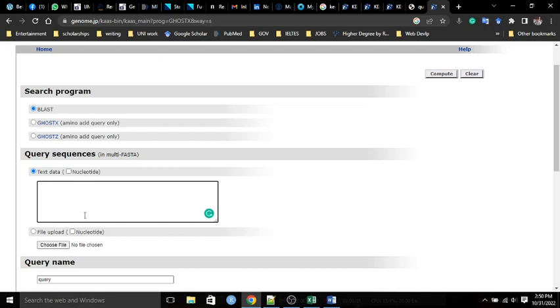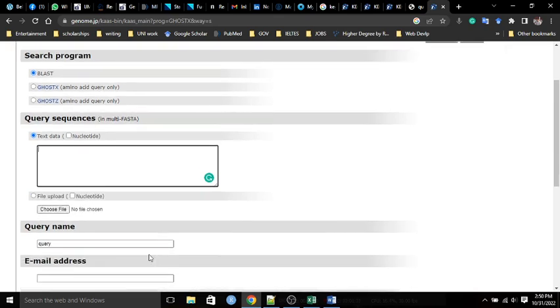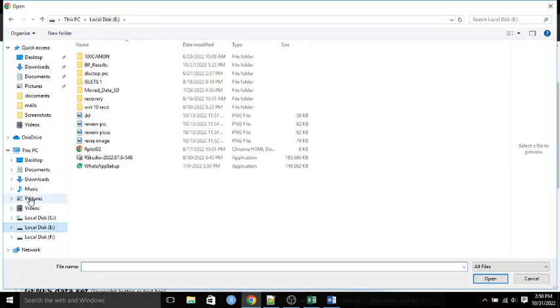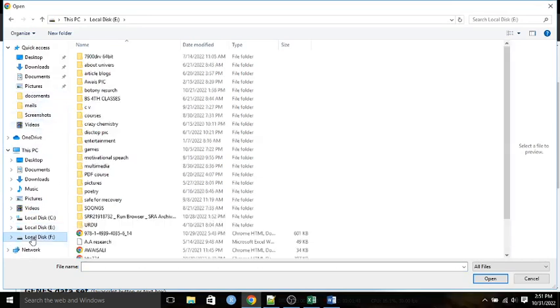If we have larger data, that larger data is sometimes in Swissprot format or sometimes in FASTA, but these data are related to the RNA sequence data, the other RAD sequence and the cDNA. First of all, we must choose our file from here. For example, I have a file, so we will proceed to this file.